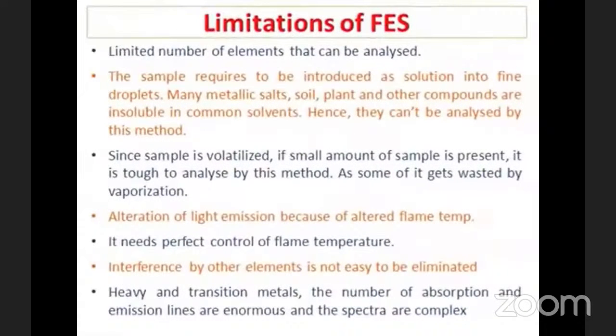Here are some limitations of flame emission spectroscopy. With the help of this method, only a limited number of elements can be analyzed. The sample needs to be introduced as a solution in fine droplets.